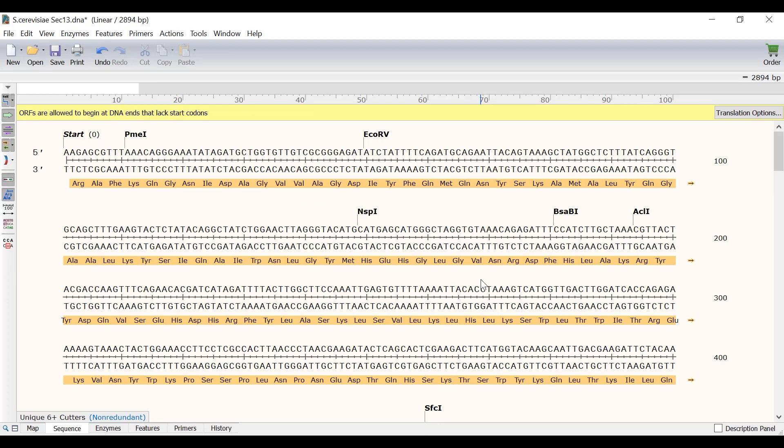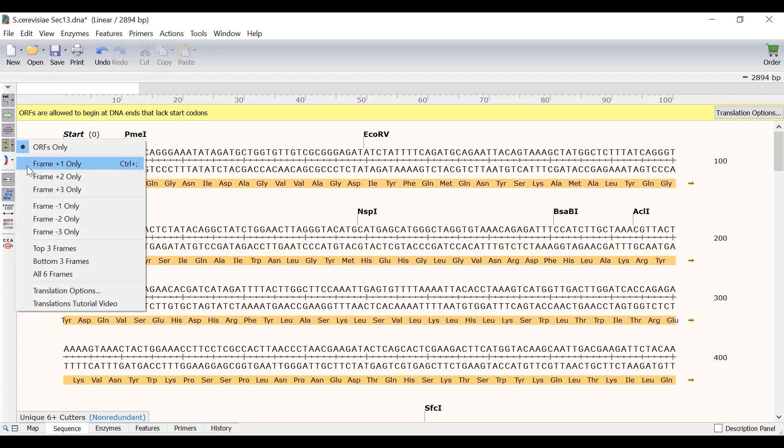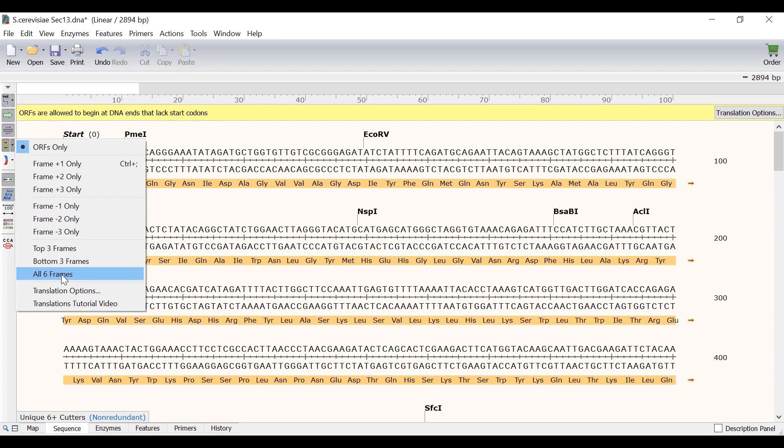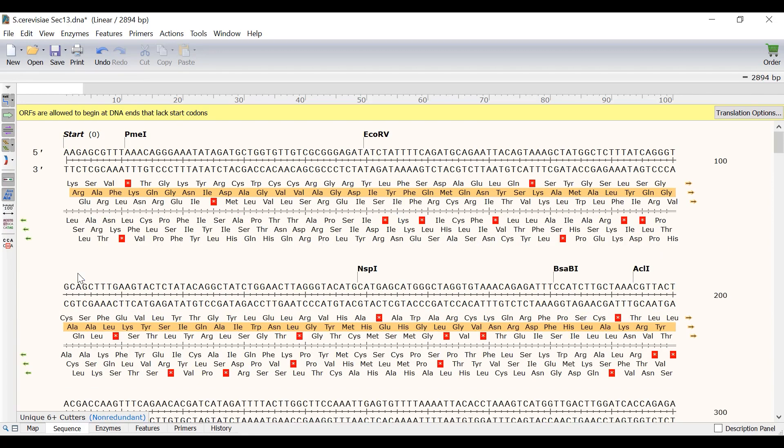Currently the show translation option is set to display open reading frames only, however by clicking the show translations button it is possible to view different reading frames: the top 3 frames, the bottom 3 frames, or all 6 frames altogether. Displaying all of this information at once can sometimes be quite overwhelming.